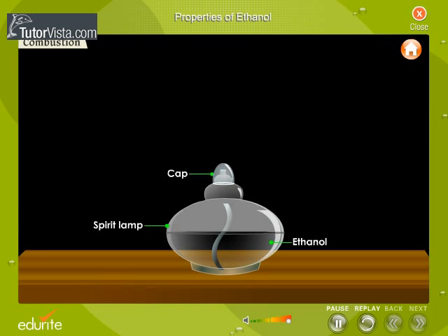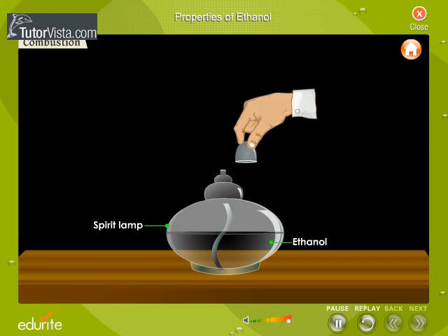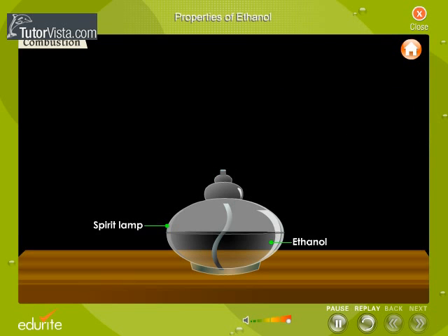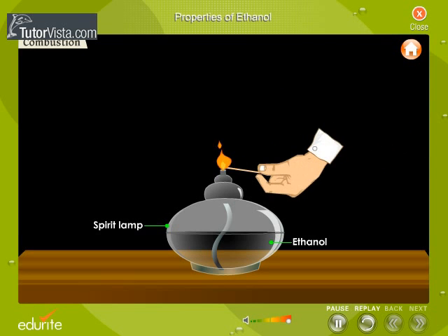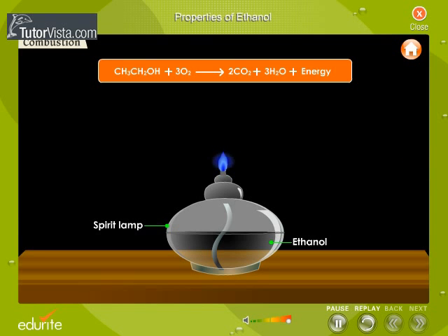Combustion. Seen here is a spirit lamp used in laboratories. The liquid present in the lamp is ethanol, an alcohol that is used as a fuel in the spirit lamp. Ethanol burns in the presence of oxygen with a blue flame and energy is released in the form of heat. Due to this reason, ethanol is used as a fuel in spirit lamps.